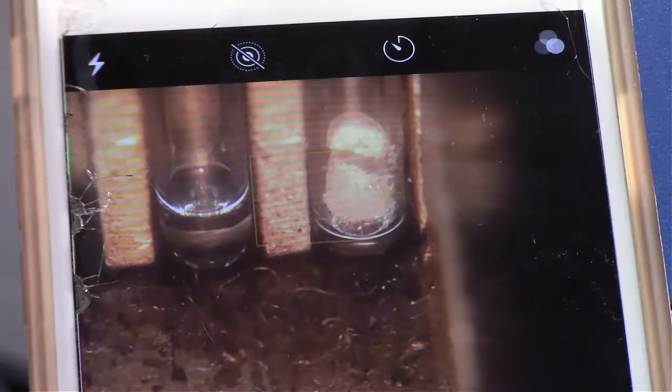Now, when we look at the right, if I saw this and wasn't sure there was filter paper on it, I would still be questioning some things. You've got some solid suspended up on that paper having no contact with the surface of the glass. So I think that's why you see a little bit more starting to slowly melt in there.